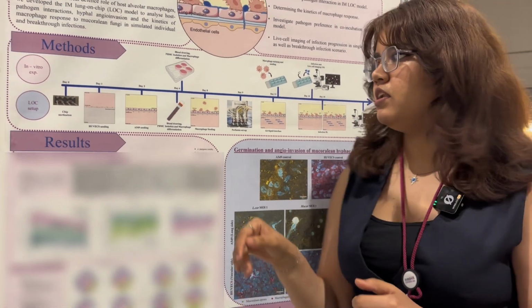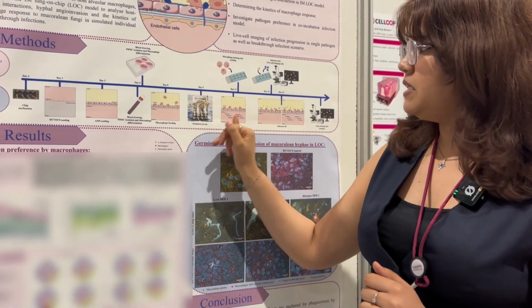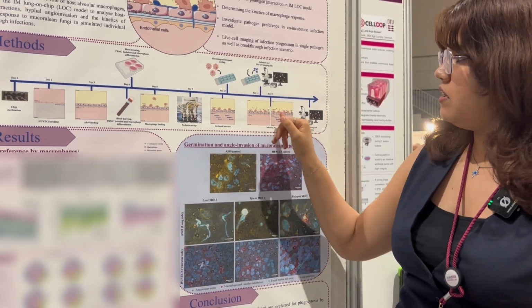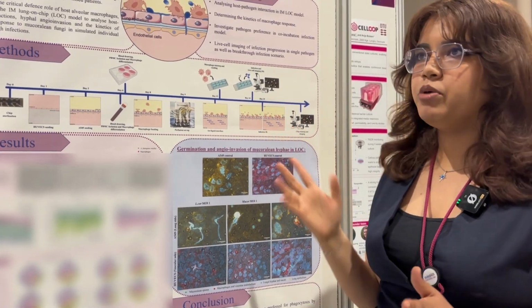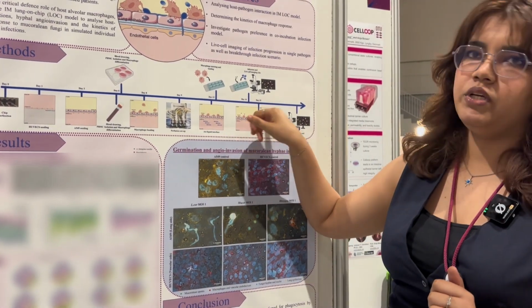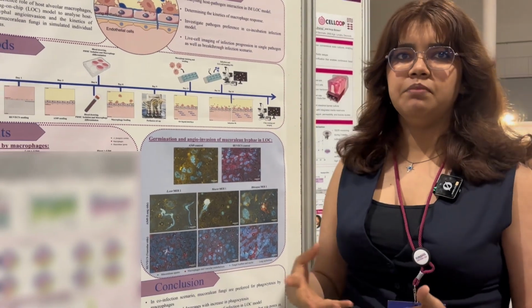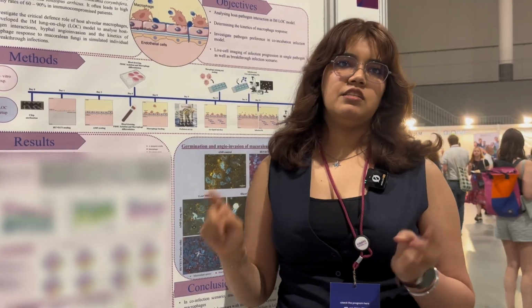To this model, then we have a perfusion setup, so to have media perfusing through the vascular side, which mimics blood flow, and eventually we infect the model with the fungal spores, where it is 1.5 hours of static, you can say static infection, and then 3.5 hours of infection via perfusion. And then eventually these chips are then stained and imaged depending upon if we want to do live cell imaging, we want to do endpoint staining, and that's how we analyze our chip.